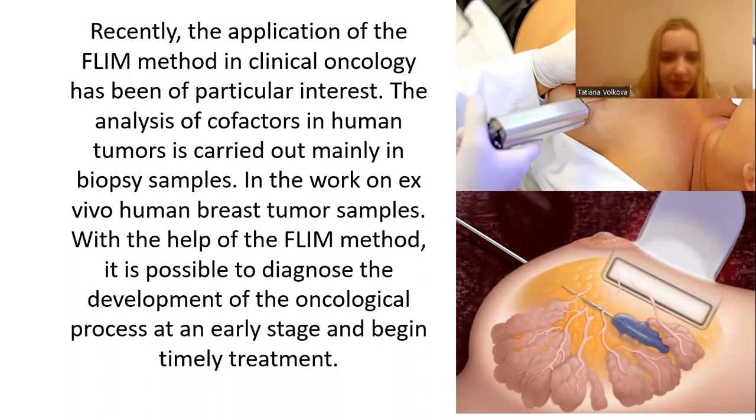Recently, the application of the FLIM method in clinical oncology has been of particular interest. The analysis of cofactors in human tumors is carried out mainly in biopsy samples. In the work on ex vivo human breast tumor samples, it was revealed that tumor cells with desmoplastic reaction had a shorter lifetime of radiation-induced fluorescence compared to tumor cells in which this reaction was not observed.